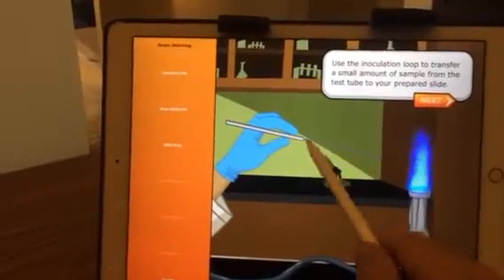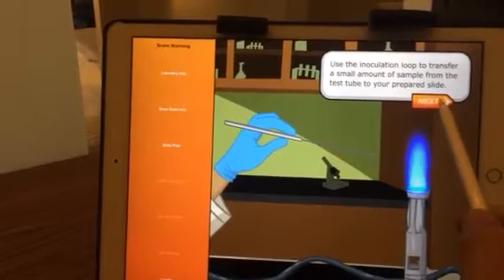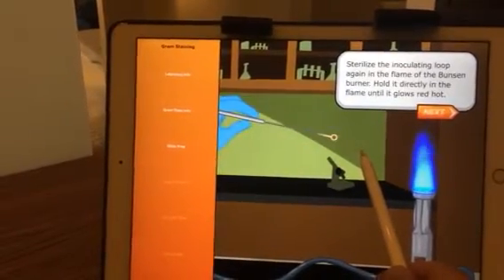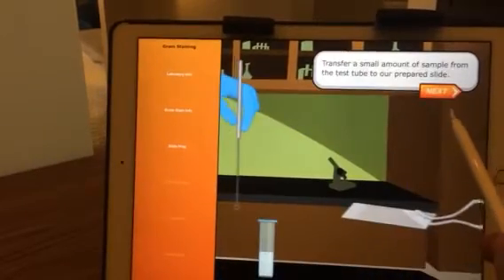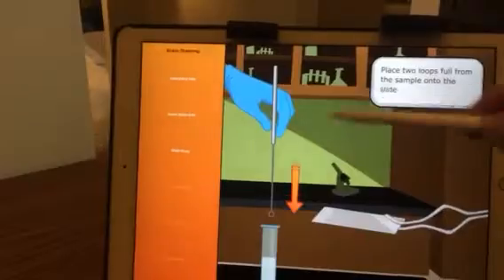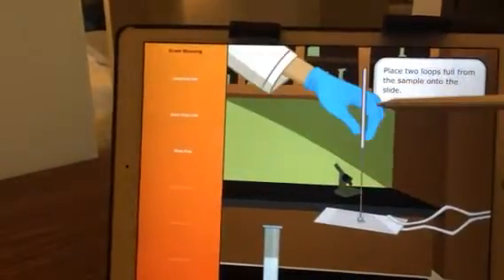Use the inoculation loop to transfer a small amount of sample. Sterilize the inoculating loop again in the flame of the Bunsen burner. Hold it directly in the flame. Transfer a small amount of sample from the test tube to our prepared slide. Place two loops full from the sample onto the slide.